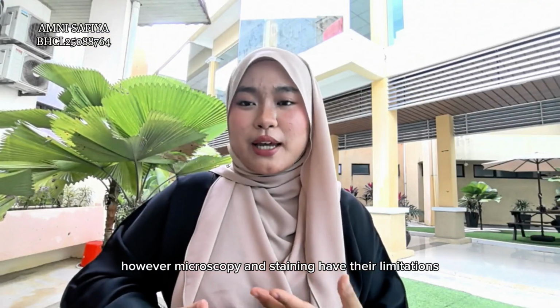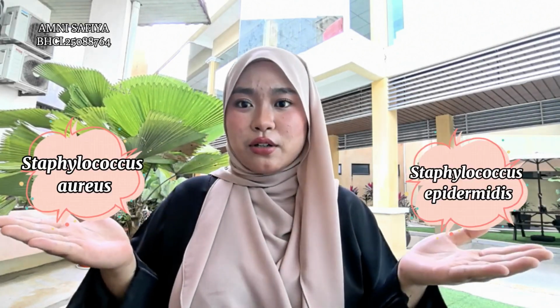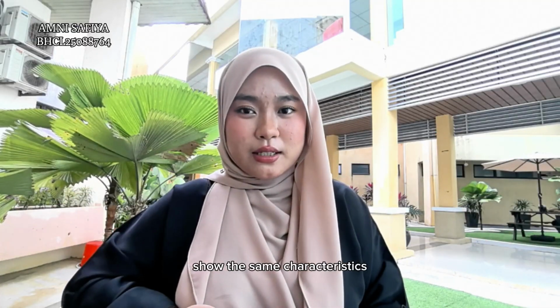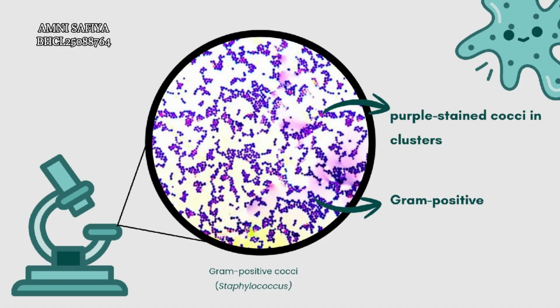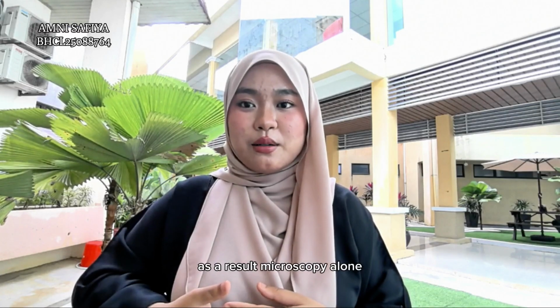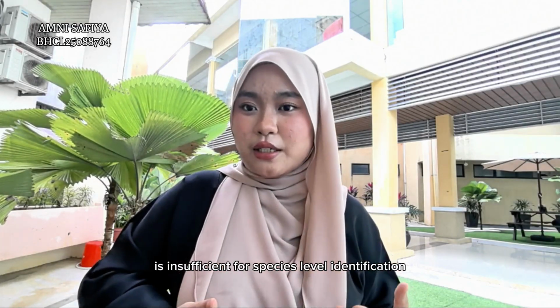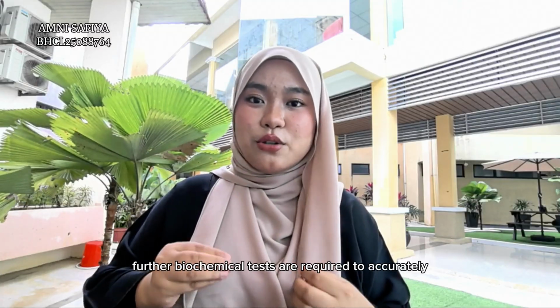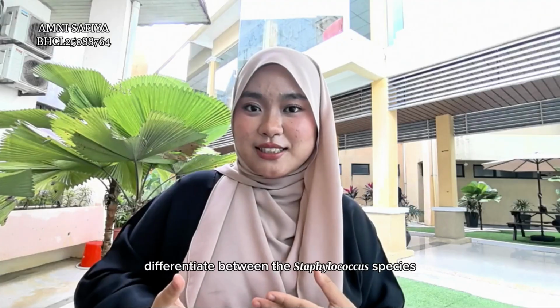However, microscopy and staining have their limitations. These methods cannot differentiate between Staphylococcus aureus and Staphylococcus epidermidis. This is because both species show the same characteristics, which are gram-positive, purple-stained cocci arranged in clusters. As a result, microscopy alone is insufficient for species-level identification. Therefore, further biochemical tests are required to accurately differentiate between the Staphylococcus species.